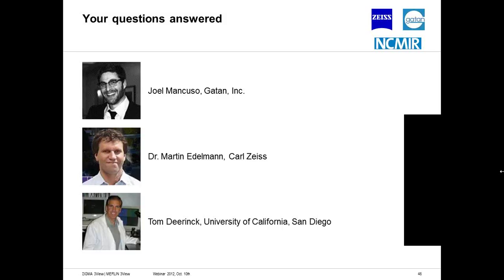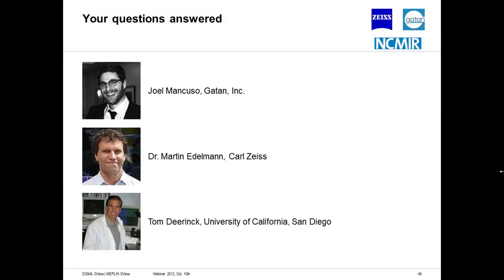One question is for Tom, actually. What is the typical duration of a 3View experiment in your lab? It varies, of course, by the type of specimen. The monolayers go very quickly because, as I said, we're operating at very fast dwell times. So you can go through whole cell monolayers at 20, 30, 40 nanometer sections in the course of just a few hours. The longest run we've done on the Merlin is about 10 days, a little bit less, continuously operating, where we generated about 5 terabytes of imaging data. And that was to traverse a very large field of brain tissue.